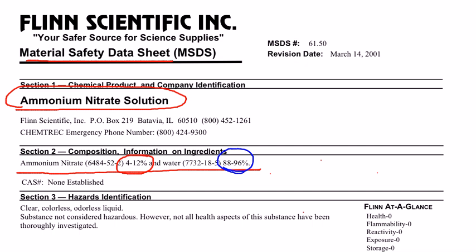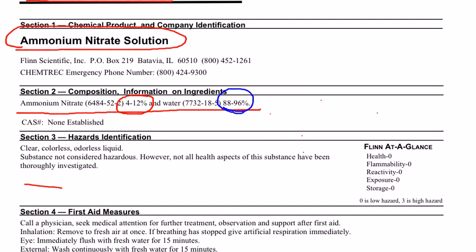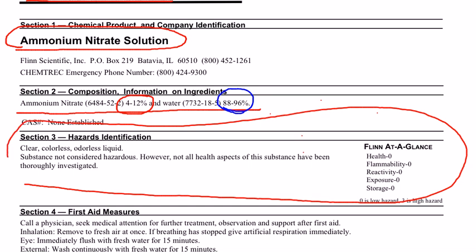While it's nice to know the composition of the solutions, we're not as concerned with that as we are with other portions of this material safety data sheet. Specifically, the hazards identification section — this is the section you really need to read carefully before the lab. About ammonium nitrate, it tells you it is a clear, colorless, and odorless liquid. The substance is not considered hazardous; however, not all health aspects of this substance have been thoroughly investigated.